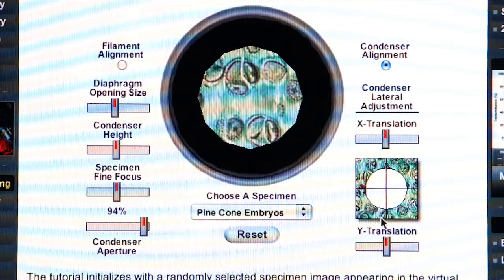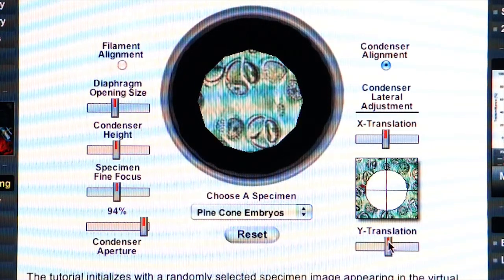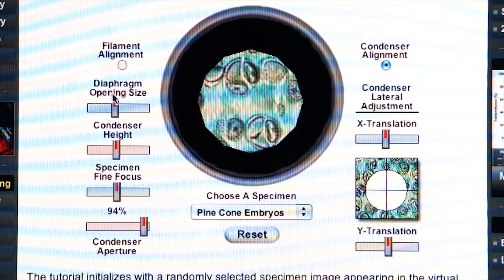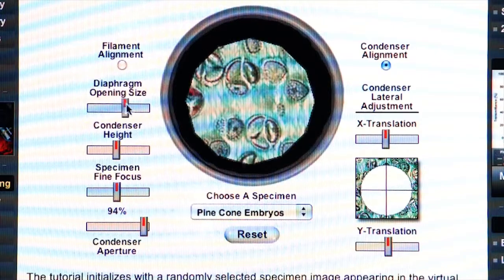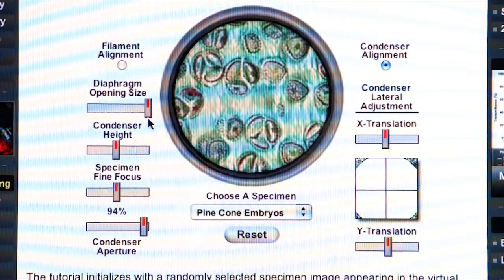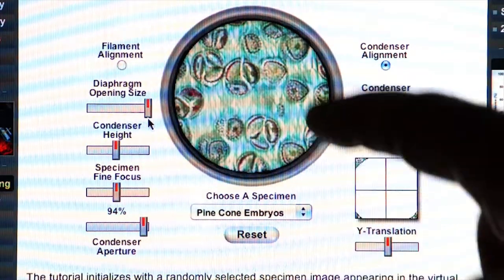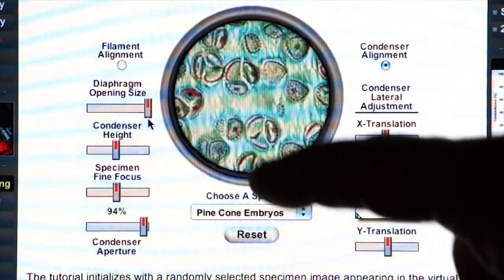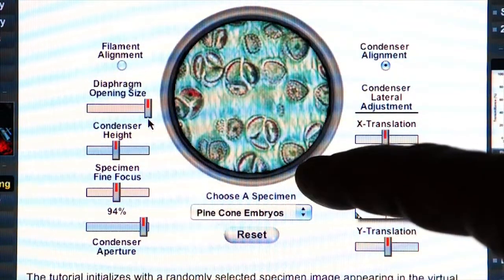You get it as aligned as you possibly can. And then you open the diaphragm to just outside the field of view. Now your microscope is aligned both optically and with the light path.